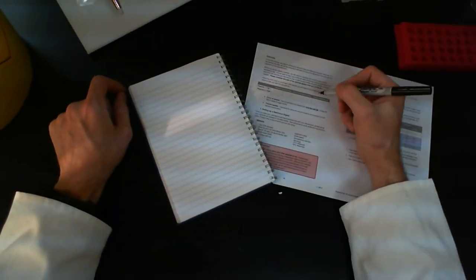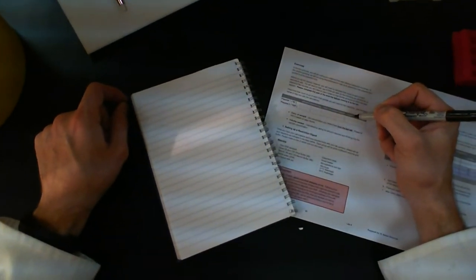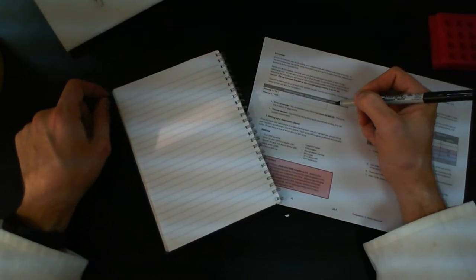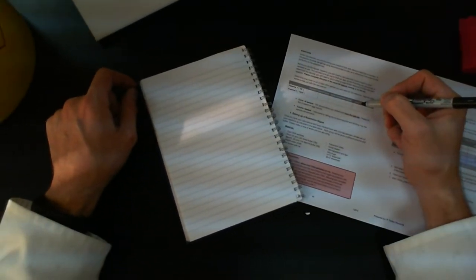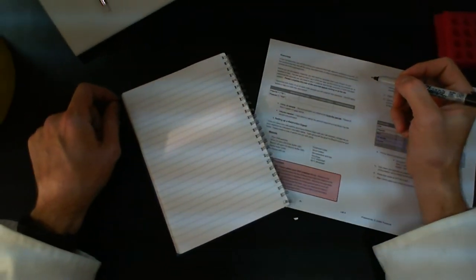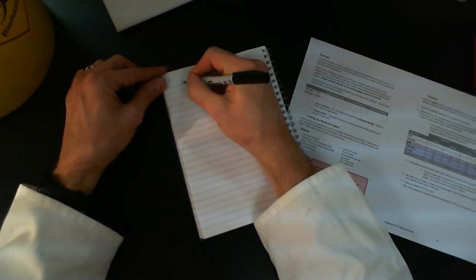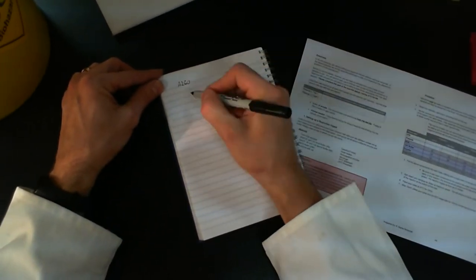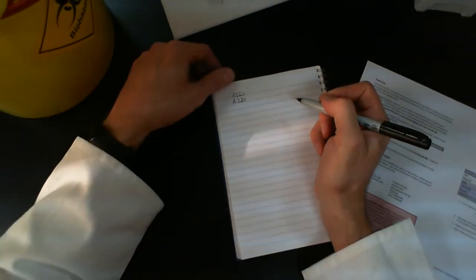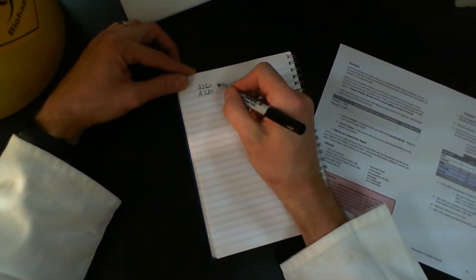What you have here is a table that's asking you to figure out what volume of your sample you need to use. So recall from last week, you determined the concentrations of your samples, at least I hope you did, or at the very least you have some absorbance values. Remember you measured your absorbance at 260 and an absorbance at 280 nanometers.